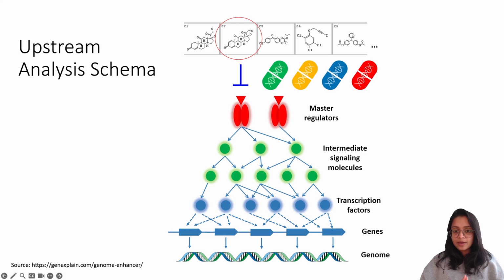So in this step, the HumanPSD database is employed to identify drugs that have been tested in clinical trials. The cheminformatic tool PASS predicts small molecules that affect the identified targets. Finally, Genome Enhancer generates a comprehensive report about the personalized drug targets that are identified for a certain patient or a group of patients, and the drugs that may be effective in this case.